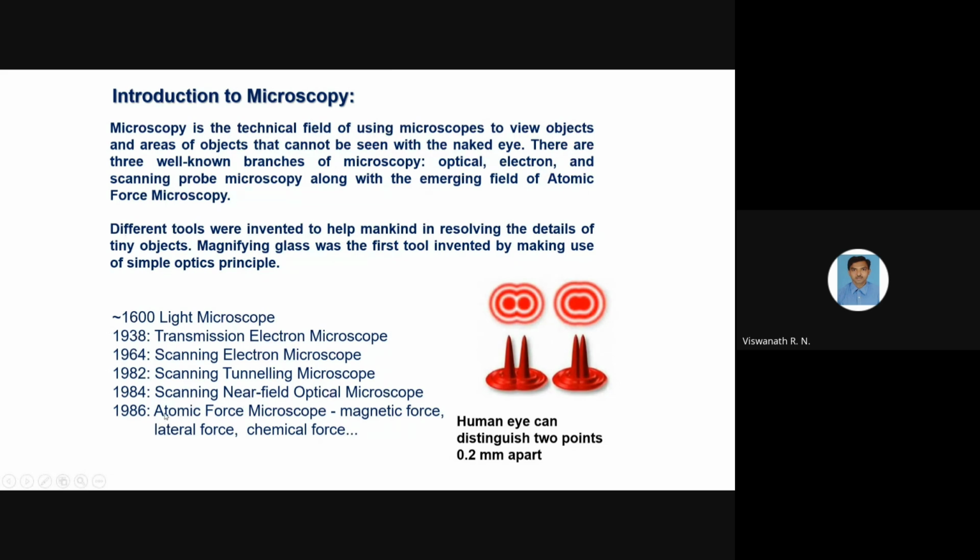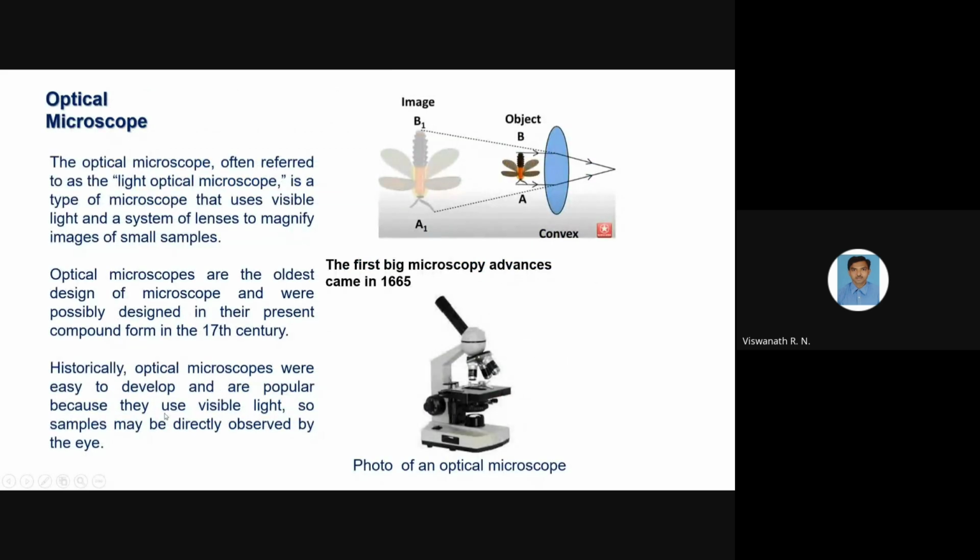Then the atomic force microscope, I will discuss one by one. With an optical microscope, basically any lenses, you see a magnified image through our eyes.